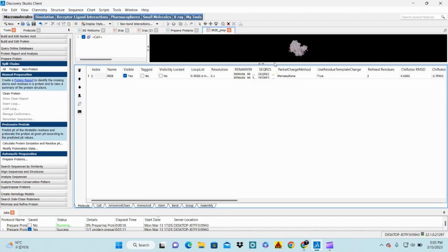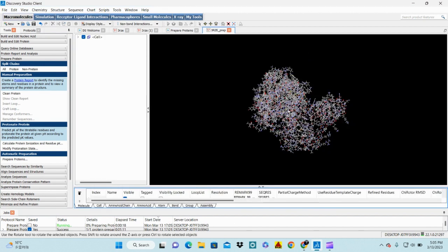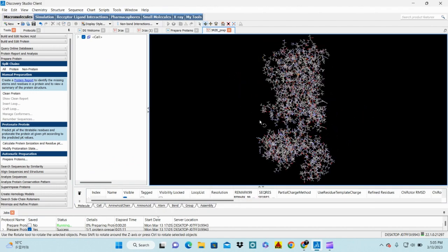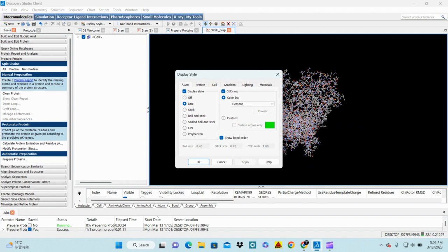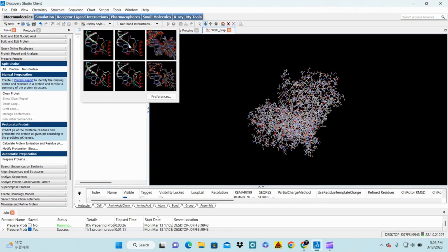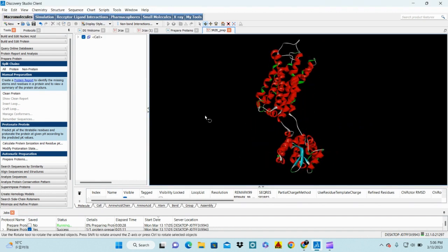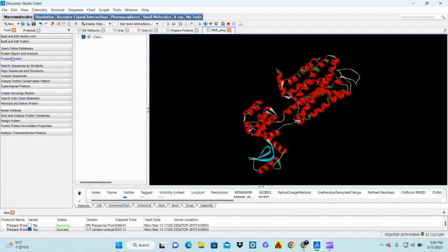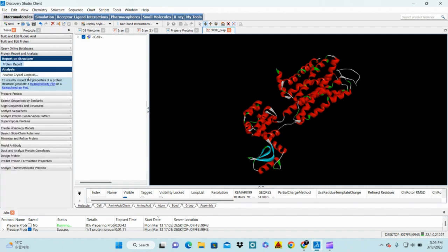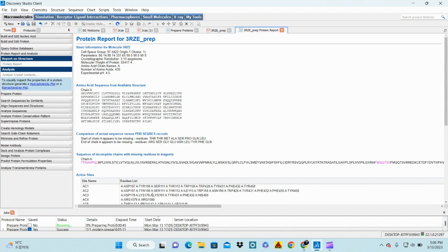When you click on Review Result, you will see the prepared protein structure. You can change its display style by clicking on Display Style and choosing whichever you prefer. Now check again whether your protein structure has any bad or distorted sequences by clicking on your protein and then checking the Protein Report.